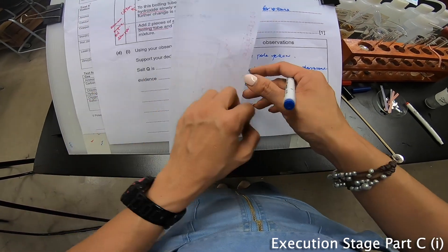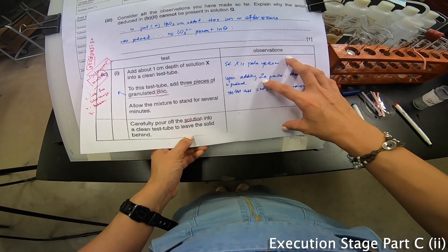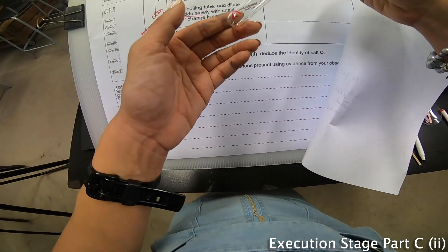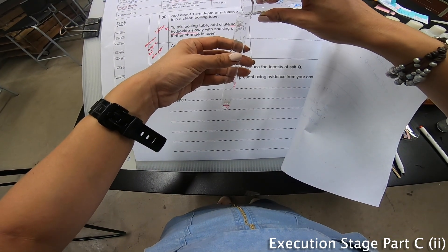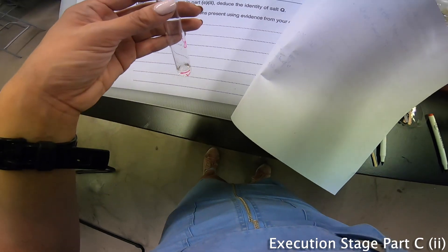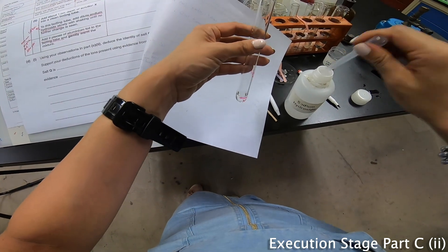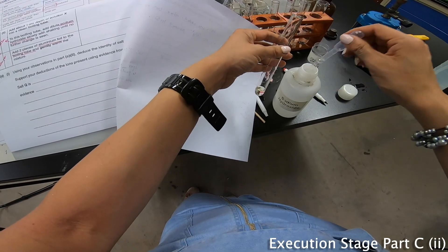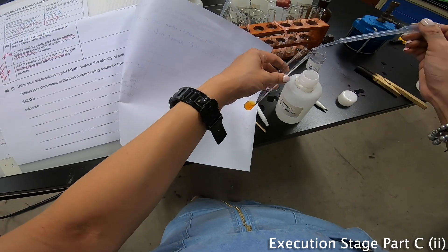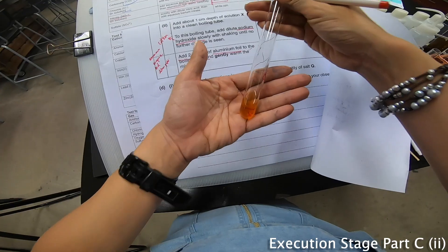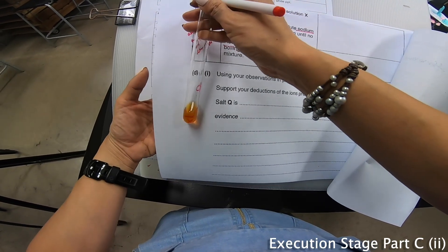Pour off the solution into a clean test tube to leave the solid behind. They say add about one cm, so I'm going to leave this first. To the next portion, I add another X inside. Then now I add sodium hydroxide. I saw brown precipitate forming. You can see there's brown precipitate forming. With the white background is even better.